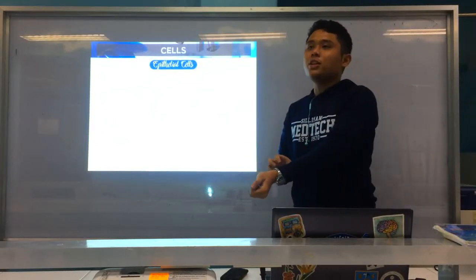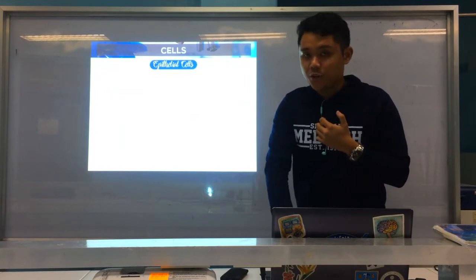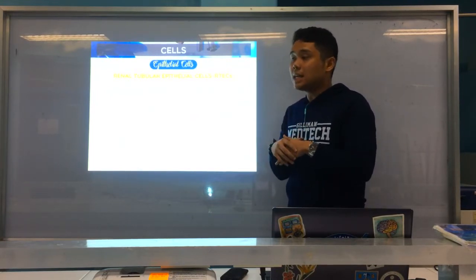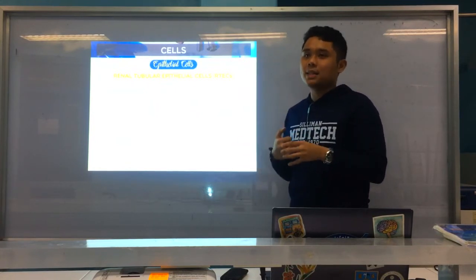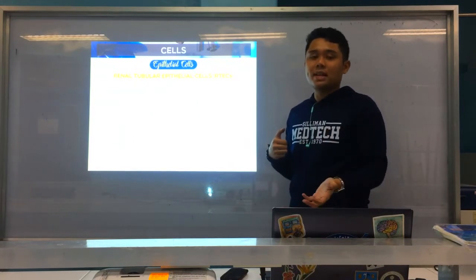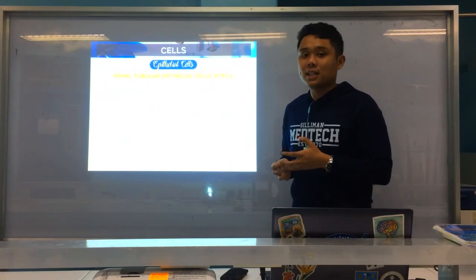Okay, all right. So now we'll continue to the last type of epithelial cells, and that is your renal tubular epithelial cells, or your RTECs or RTEs. Now, this is the most significant na epithelial cell. If pauntahan can say largest cell gyud, it's your squamous epithelial cell. But when you say the most significant epithelial cell, that is your RTE.